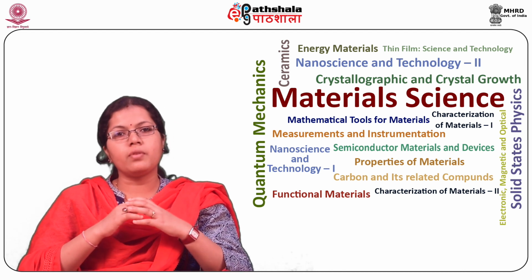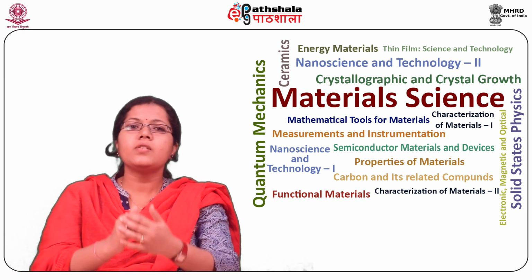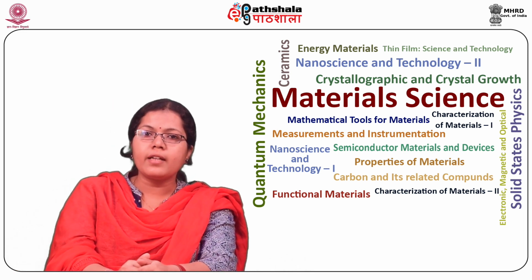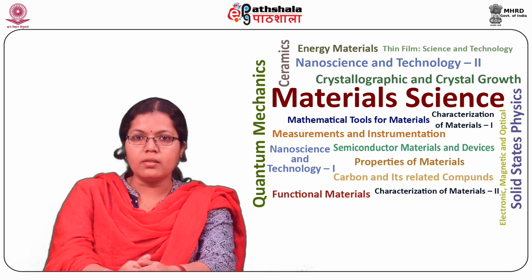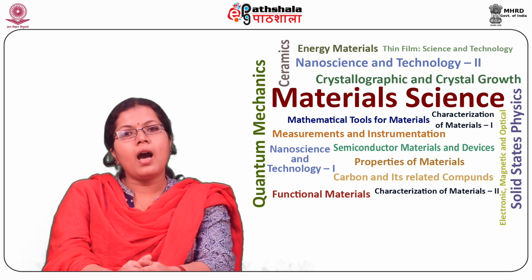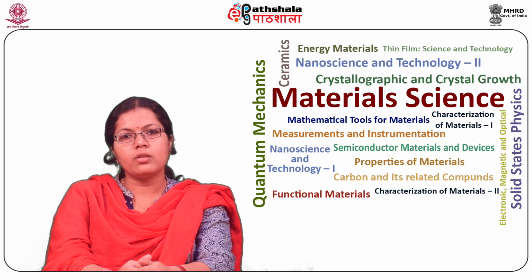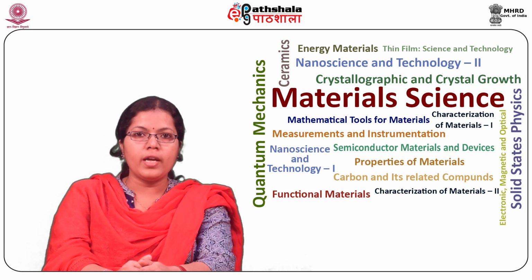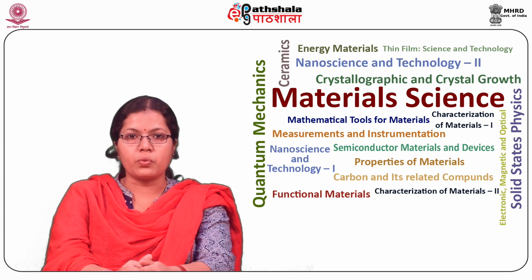The work function of the metal is responsible for the emission process. This work function can be affected by the adsorbed gases. This is the reason for the very high vacuum requirement. Sustaining high electrical field gradients is similarly important to emission. So, a tip that is damaged might not produce electrons at all.